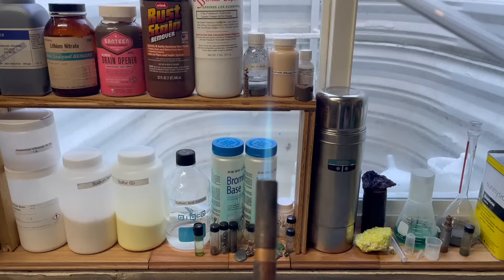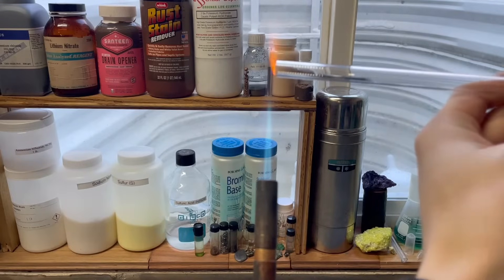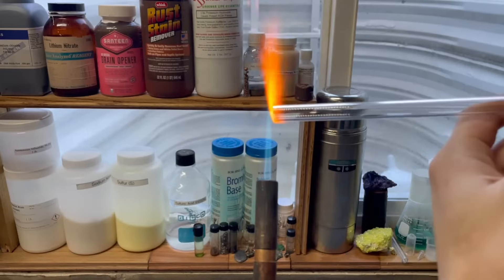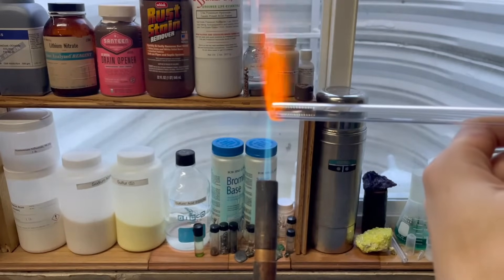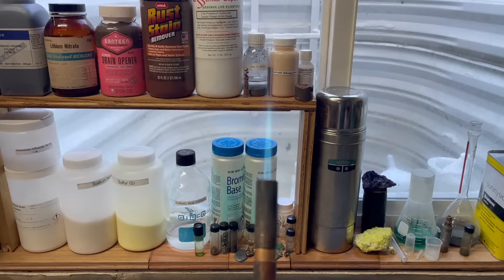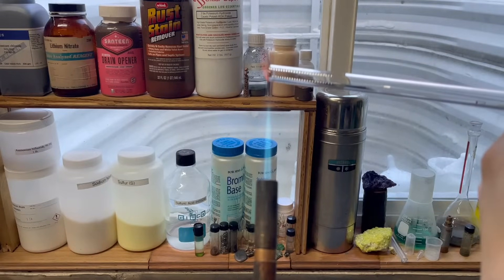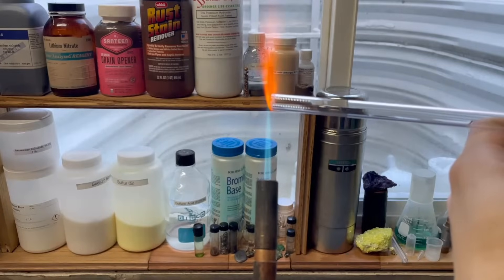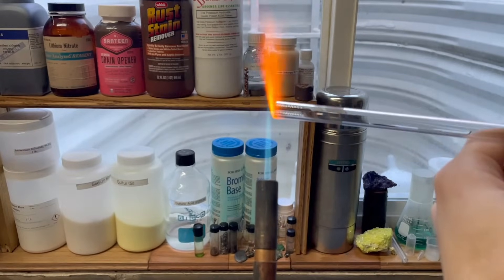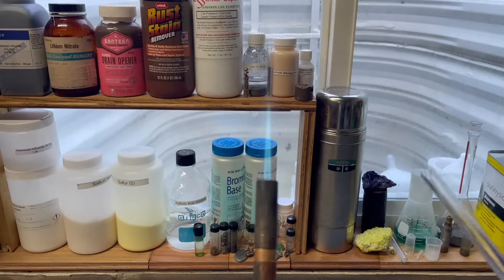We're going to slowly bring the glass into the flame — don't go too fast or the glass will shatter. You're going to want to rotate it as you do, and there it is, all fire polished. Now let's do the next piece. And now that piece is all fire polished up. Let's set these off to the side and let them cool down.